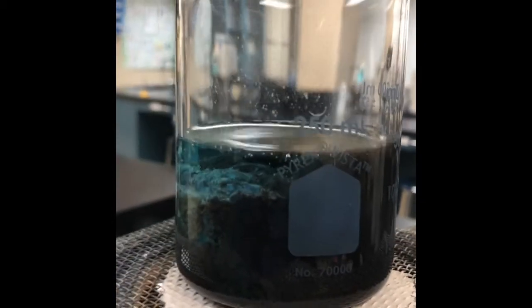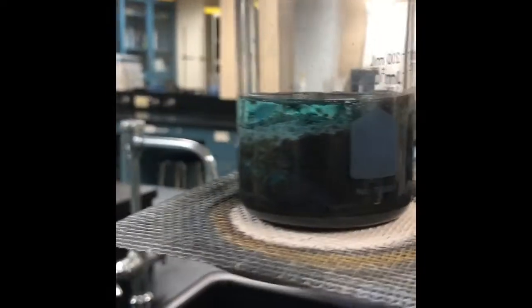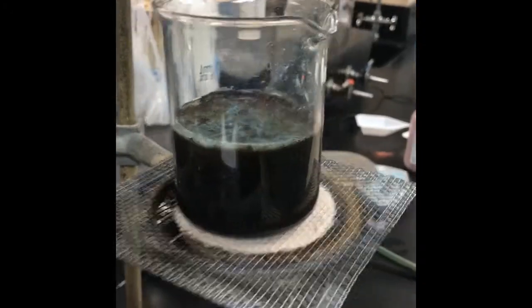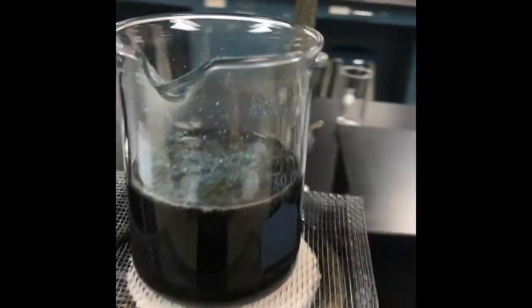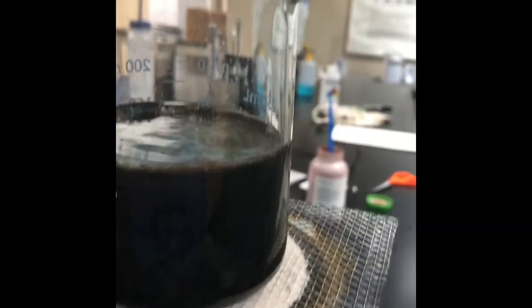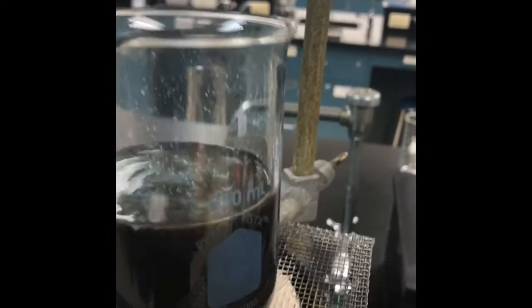It continues to boil. We can see that it's going to be converted to copper 2 oxide as we heat it up. Okay, so we're going to keep going until it's almost to a boil. And so we see more and more of it is being converted. As we near the end of this reaction, we're going to heat it until it just begins to boil. So we're almost to that point right now. The next step is going to be, we're going to let that solid settle, and we're going to decant the supernatant liquid.